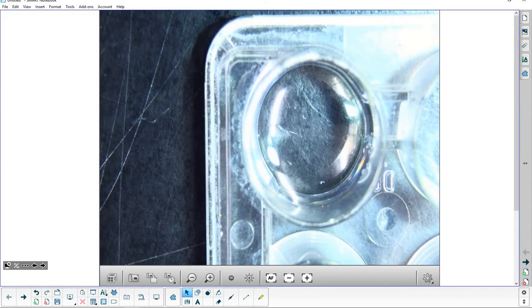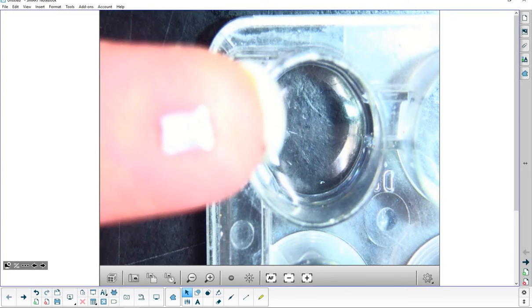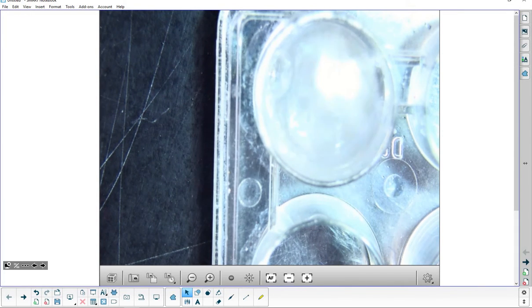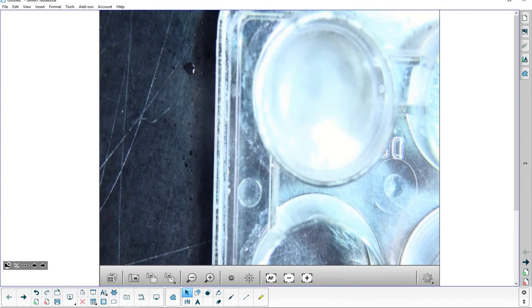What you're going to do here is you could take your little piece and cut it up into tiny, tiny little pieces and different variations of size for particle size. You could do concentration. You could put the well plate on ice. You could put it on a hot water plate to change the temperature. So on this one, when you put it in, you're looking for how long it bubbles or effervesces. It works a lot better on the black, so don't put white under this one. On the Petri dish, I would get a paper towel and put white underneath it, because it's a lot easier to see the color change with white under it.